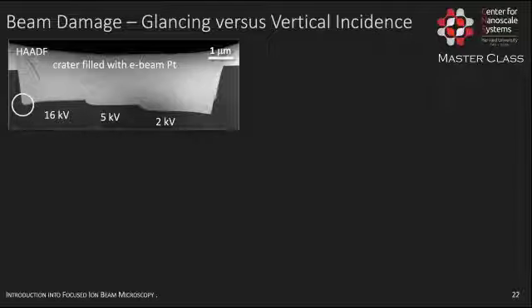The surface of the sample is where you see the y-axis on the left side. On the right side, you see a periodic array, and this periodic array is actually the atomic structure of the silicon. That tells us that the entire defect zone in silicon has been amorphized. The defect accumulation was so high that we have completely amorphized the sample.